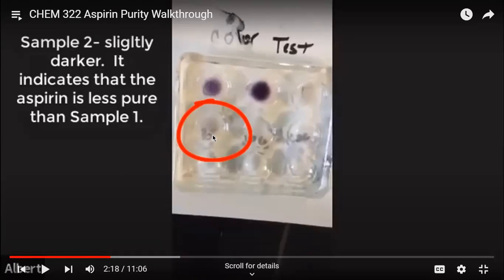And let me ask this question, and anybody can chime in here. What could you do if your aspirin sample was darker than that, and you wanted to get it pure?